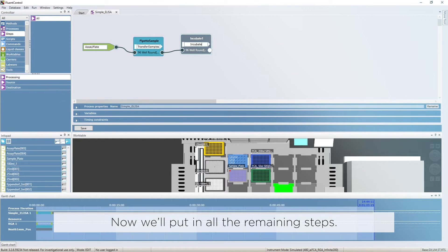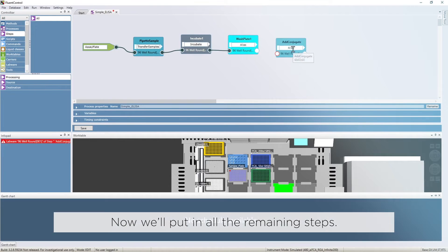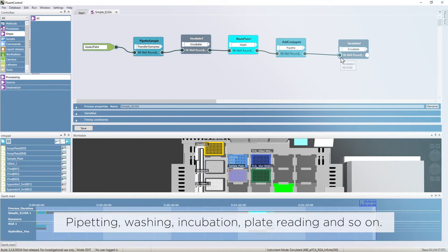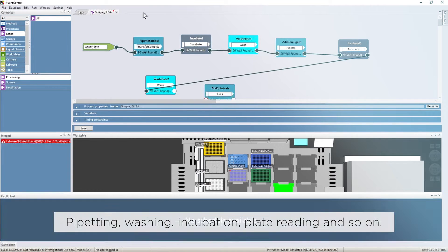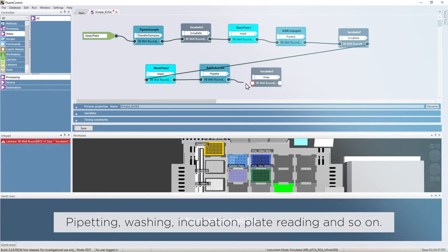Now we'll put in all the remaining steps: pipetting, washing, incubation, plate reading, and so on.